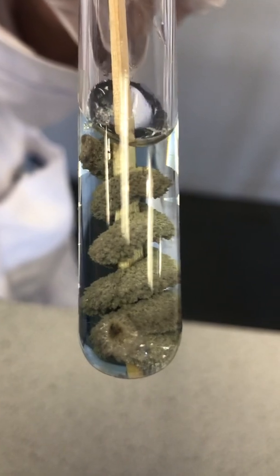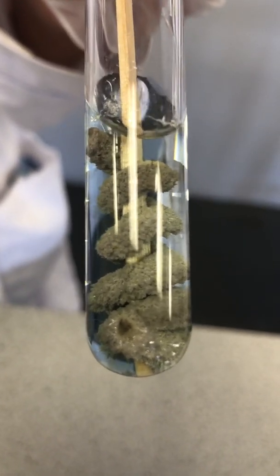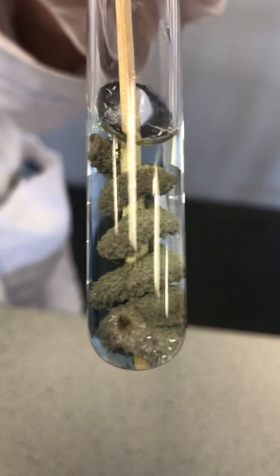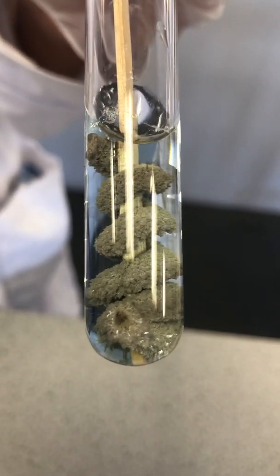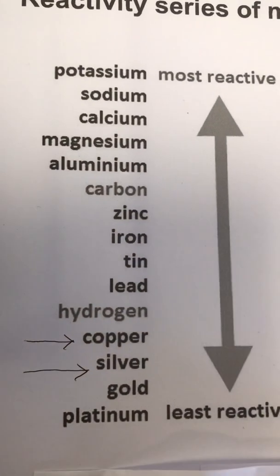As you can see, a displacement reaction has taken place and copper has displaced silver from silver nitrate solution, and hence we can say copper is more reactive than silver. See your reactivity series. Thank you.